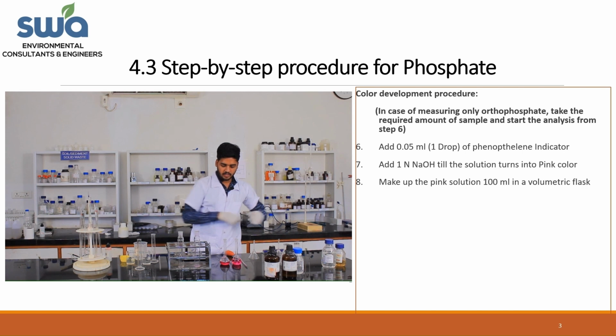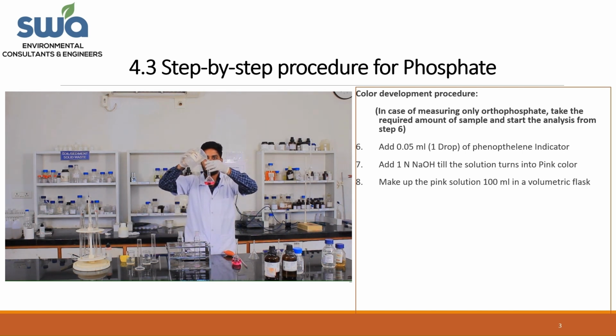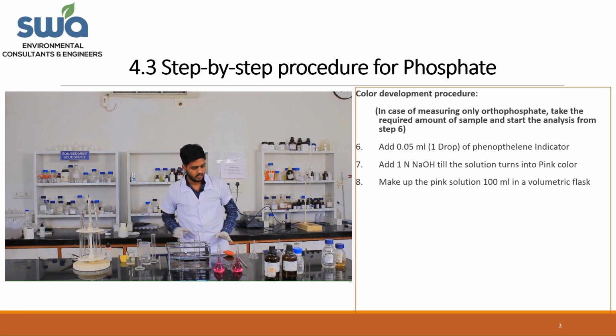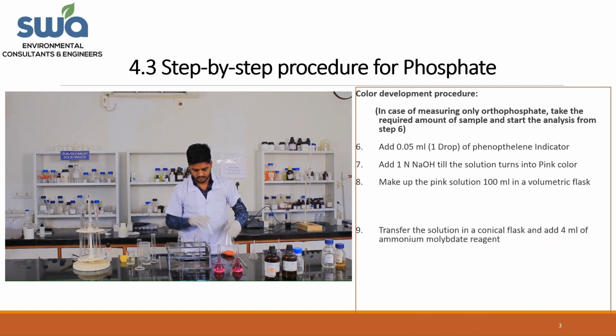Now make up both till the 100 ml mark. This is for inlet. This is for outlet. Now transfer both solutions into conical flasks.